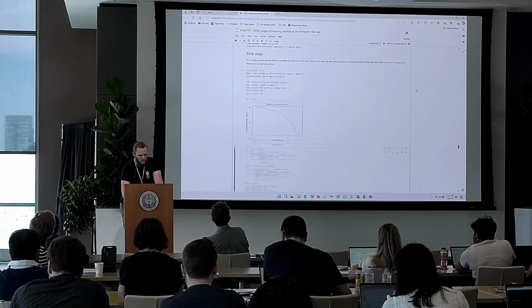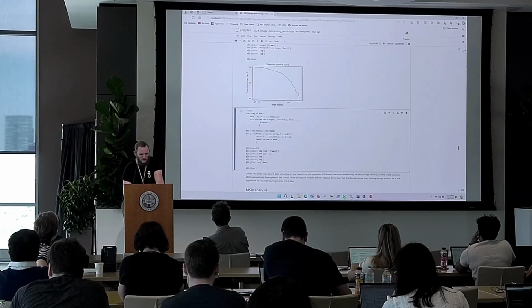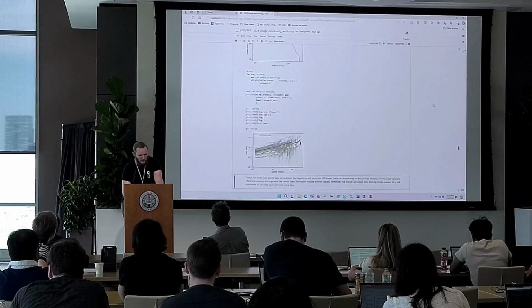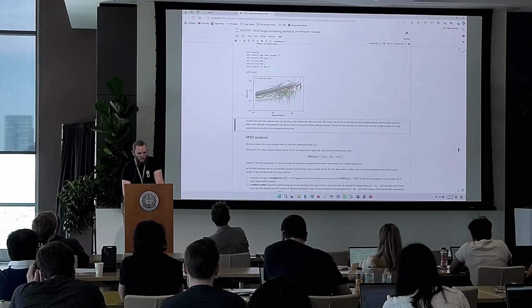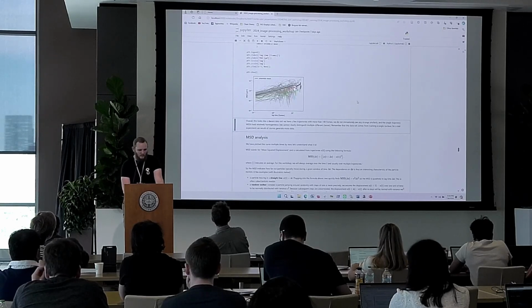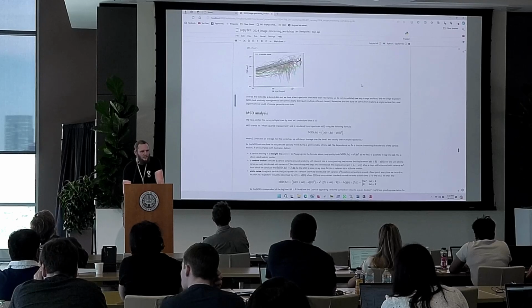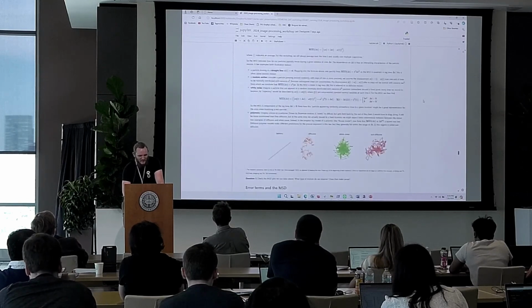First is the survival curve that we already looked at. We see that everything's longer than 10 frames because we conditioned on that. We have a few trajectories that are longer than 100 frames, which is kind of nice. Overall, this looks decent. We can plot this MSD plot again. It's the same plot as before. It looks relatively homogeneous. It's not like we have clearly two clusters of trajectories here. It looks relatively decent. That's nice. Having plotted this plot for the second time and not even told you what it is, here is an explanation. Again, it's a bit of a wall of text.